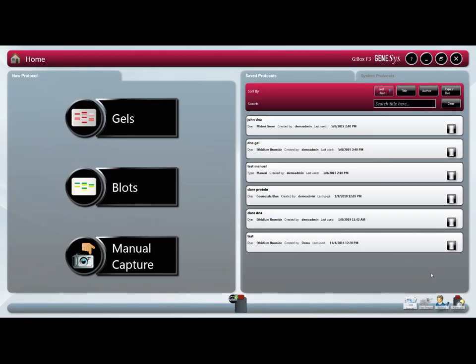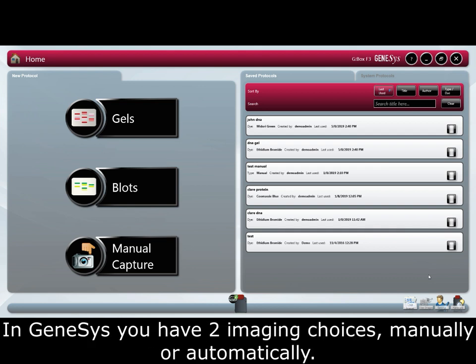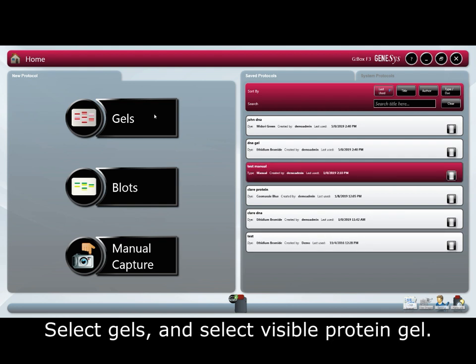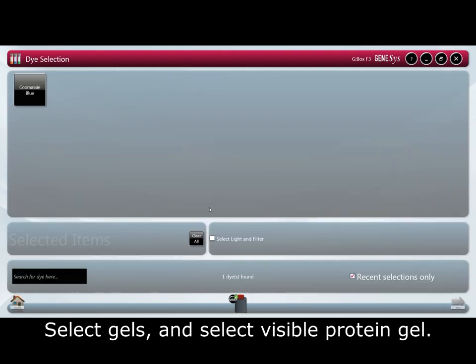In this tutorial we will be looking at visible protein gel capture. In Genesis you have two imaging choices, manually or automatically. For this tutorial we will do an automatic capture. Select Gels and then select visible protein gel.